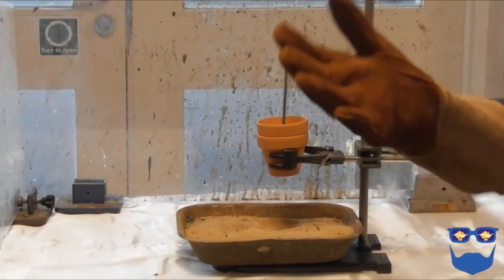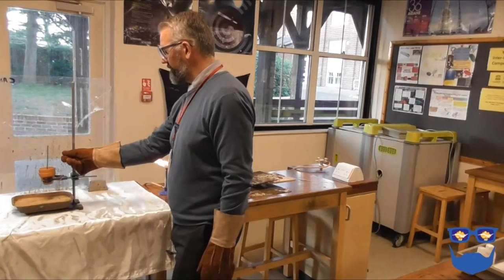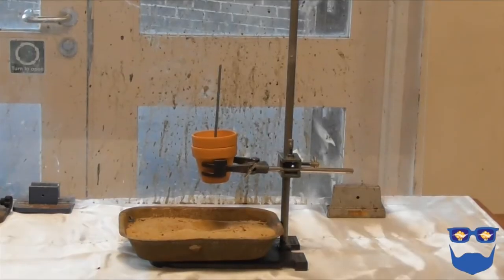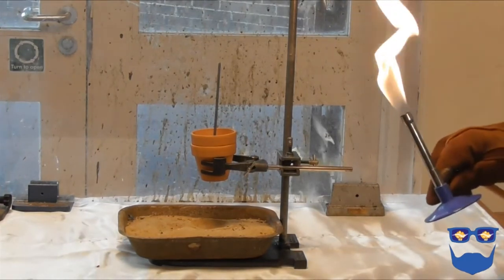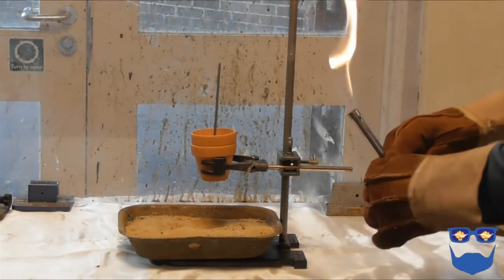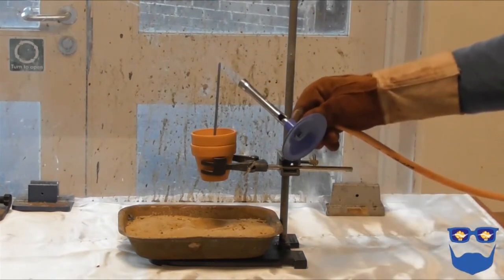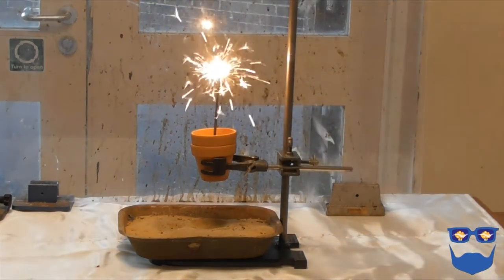You now need to consider your own safety. Wear heatproof gloves and safety glasses, and ensure your exit from the reaction is clear of obstacles. Only once you are confident of the safety of the students, yourself and the furniture, turn the Bunsen to a blue roaring flame and ignite the top of the sparkler. Retreat and observe.